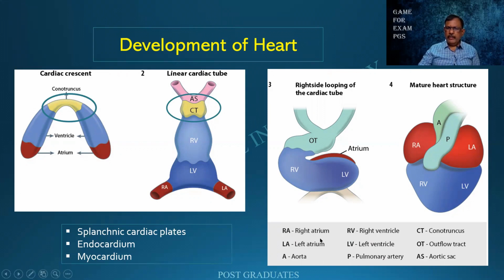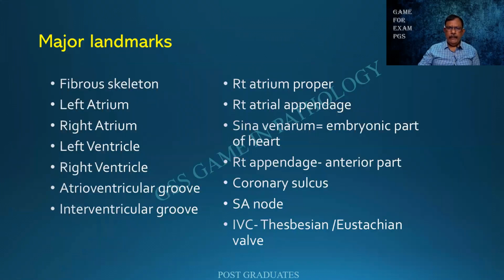These are the various abbreviations. You people can kindly follow these diagrams, which I have sorted with great pain. The heart itself has some kind of a fibrous skeleton. That is why it does not collapse like an intestine. I am not going into the chambers. There is a groove between the atrium and the ventricle and between the ventricles themselves. And there are the various structures that are there. There is something called a right atrial appendage and a left atrial appendage. The left atrial appendage will be important for sampling.